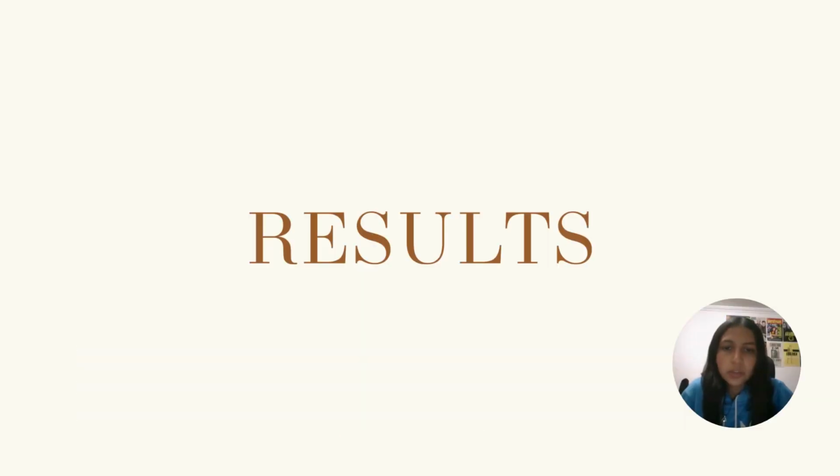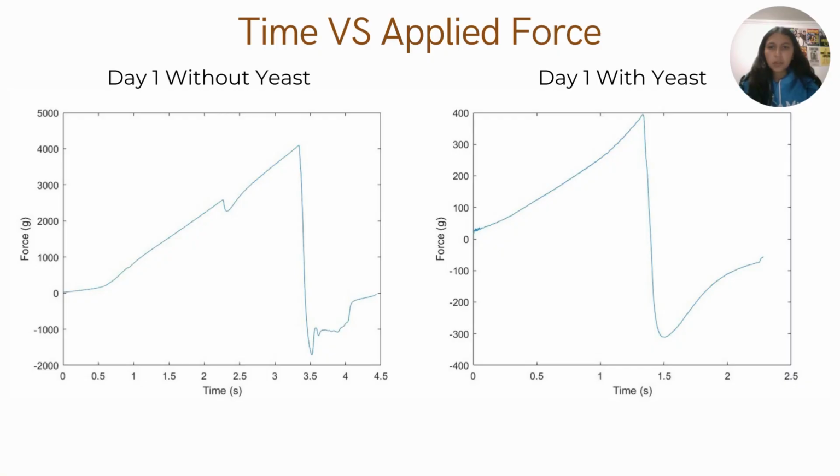Now we will present the results. First, we have the time versus force graphs for the dough with yeast and without yeast on the first day. It can be seen that the force applied grows as a function of time, and for the dough without yeast, the force is much greater compared to the dough with yeast.